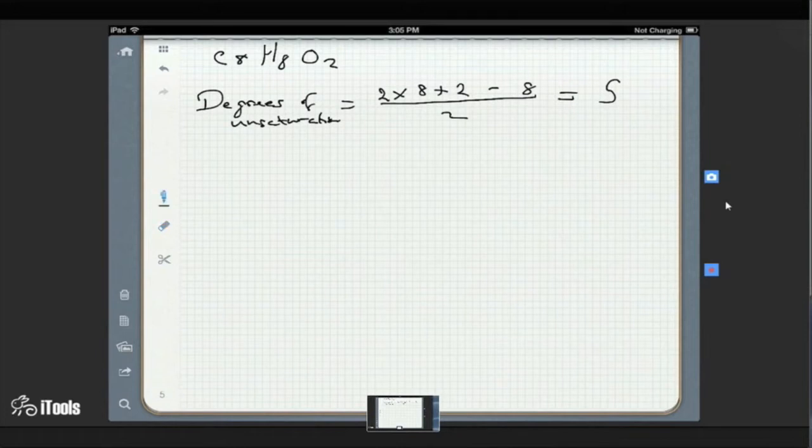Can I actually ask you something? Are we given the molecular formula to begin with, or do we have to work it out? We'll be given the mass spec and the molecular formula? We didn't learn carbon NMR, so how would we figure out the molecular formula? I thought you gave the molecular formula for the mass spec.